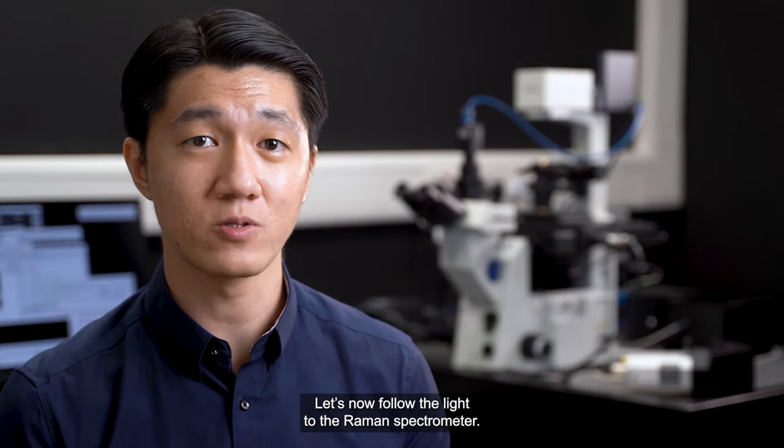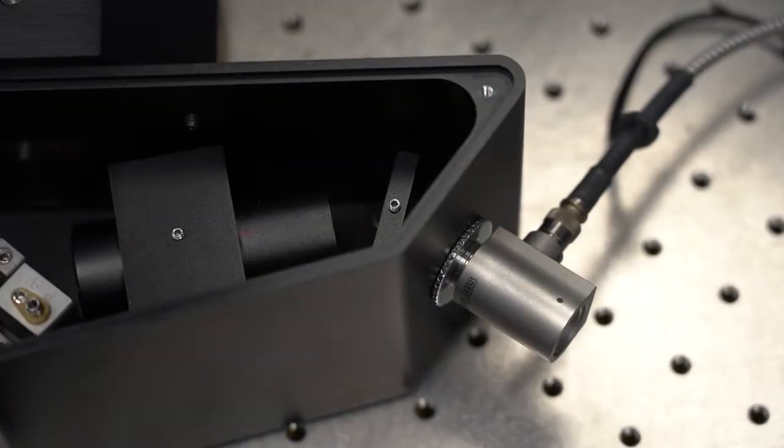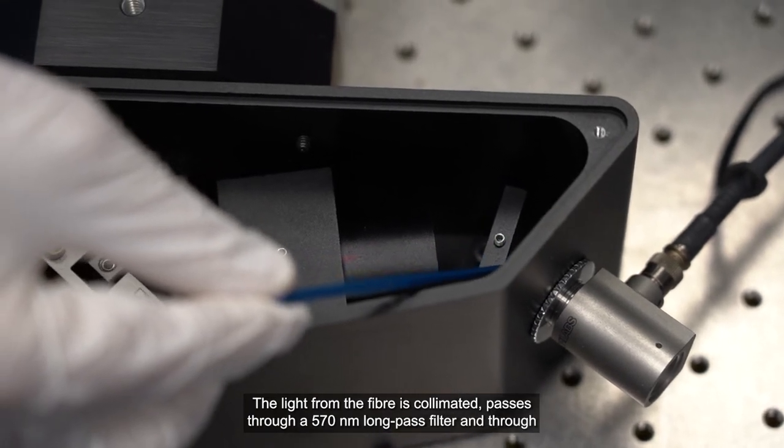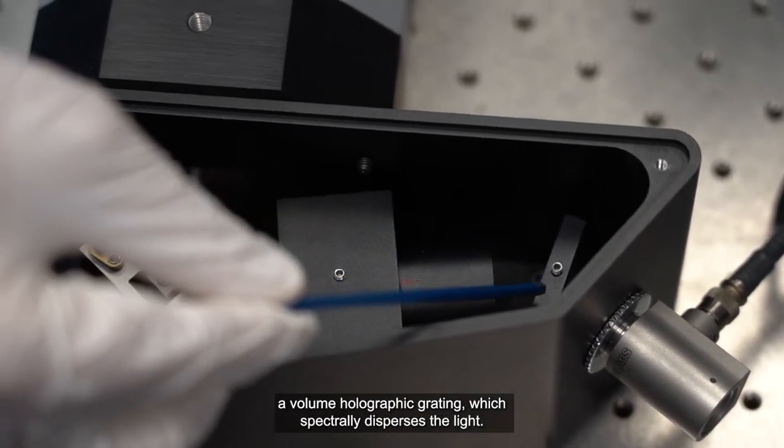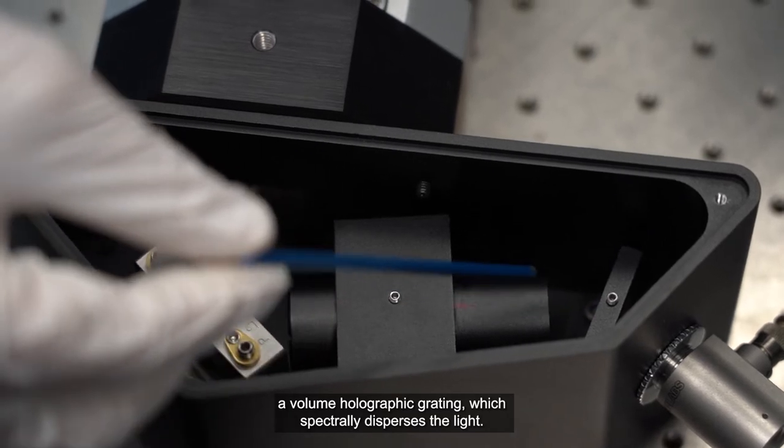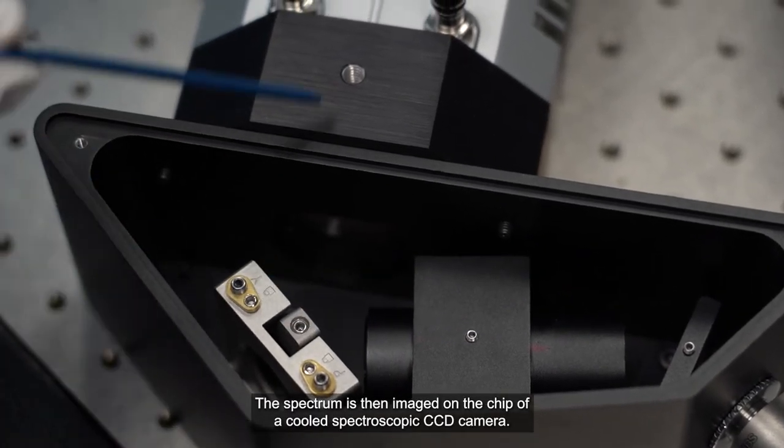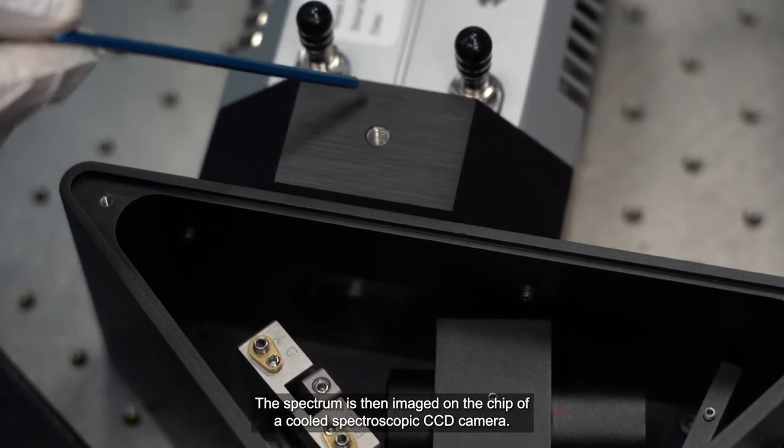Let's now follow the light to the Raman spectrometer. The light from the fiber is collimated, passes through a 570 nanometer long-pass filter and through a volume holographic grating, which spectrally disperses the light. The spectrum is then imaged on a chip of a cooled spectroscopic CCD camera.